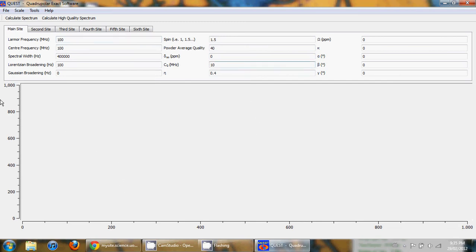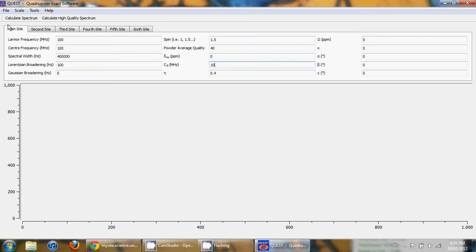The graphical user interface for this program is shown here. At the bottom of the screen there's a gray box where the spectrum will be plotted, and at the top we have the set of variable parameters which can be edited to simulate your spectrum.